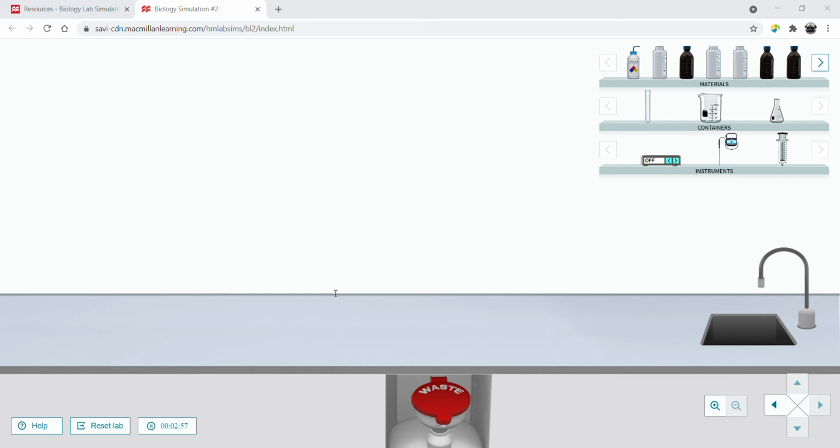It's called an iodine test, the Lugol's iodine test. If it's positive for starch, it turns a blue or black color. If it's negative for starch, it remains the color of the iodine, a pale yellow. So it goes from a pale yellow if it's negative to a bluish black if it's positive.